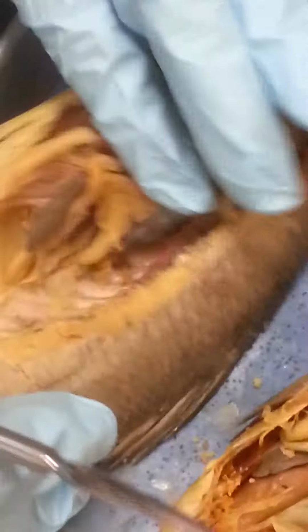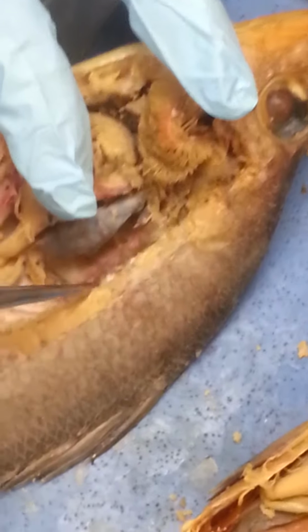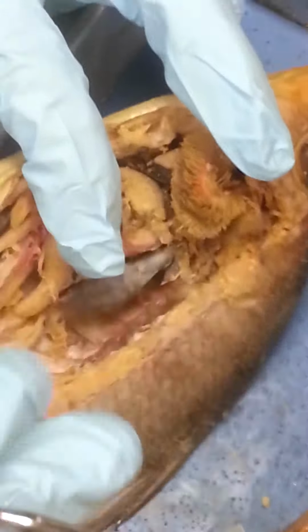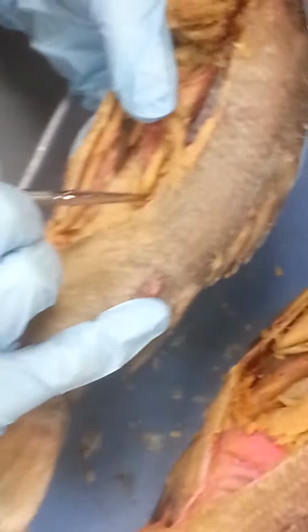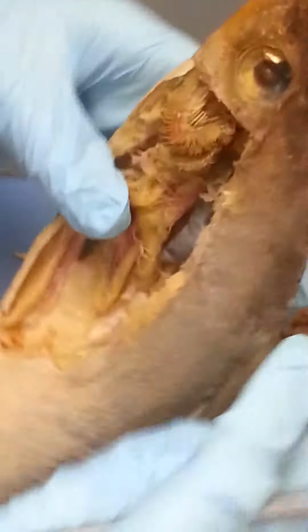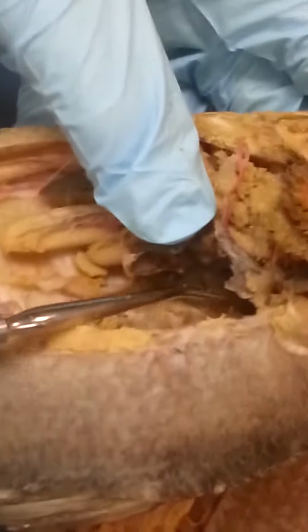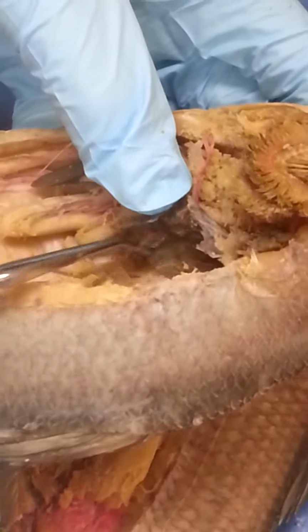Your kidney, as you guys know, is this kind of blackened region up on the top of the abdominal cavity inside the gas bladder. And your gas bladder, swim bladder, whatever you'd like to call it, is just kind of this broken membrane. This fills this whole cavity. And on a fresher specimen, there's a gas gland, which is kind of this black structure. It's kind of merged onto this now, but it's kind of a liquidy black structure.